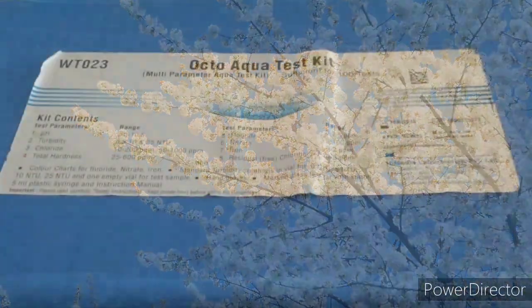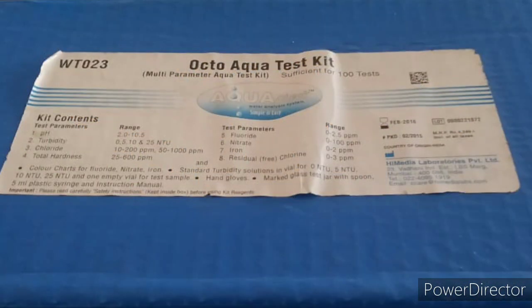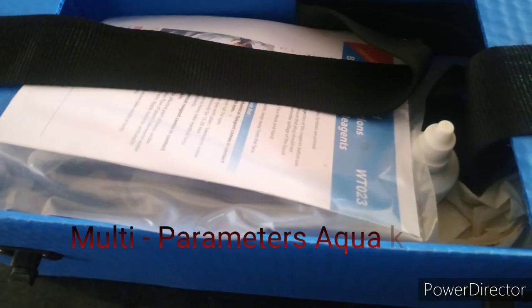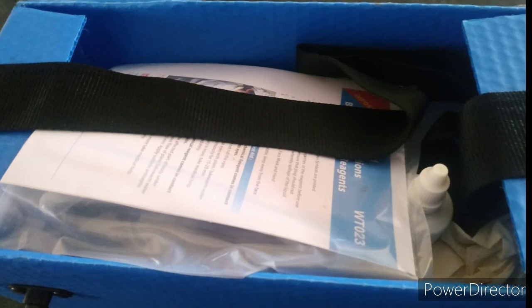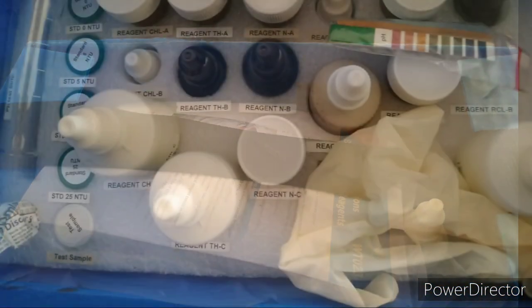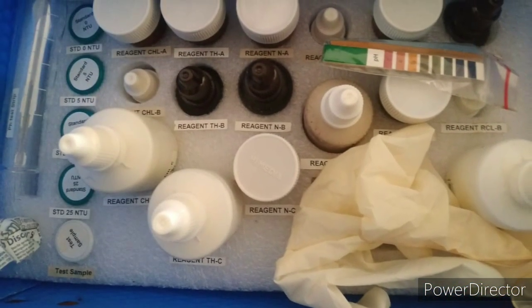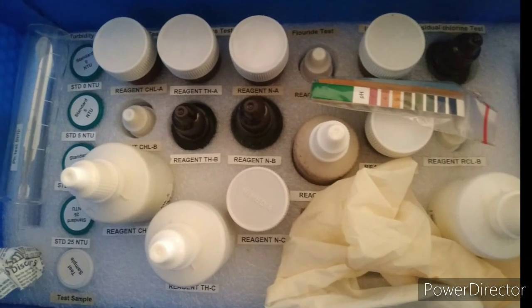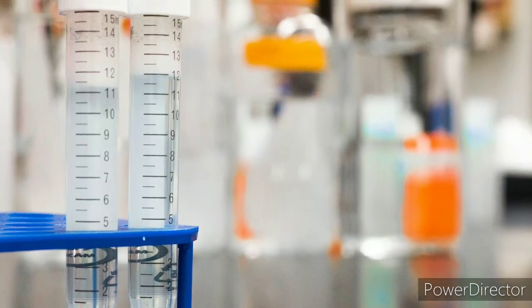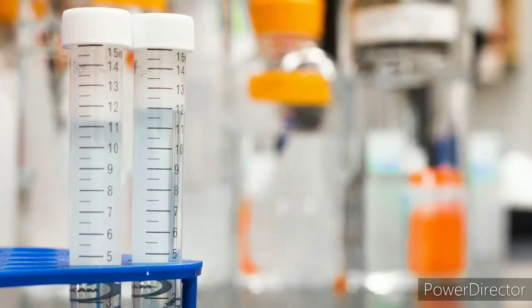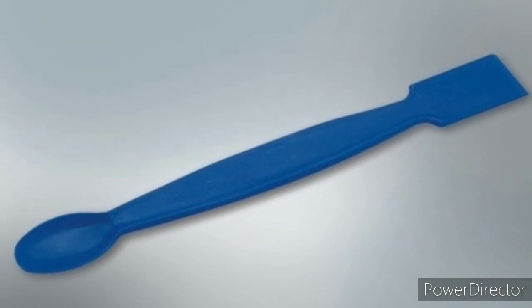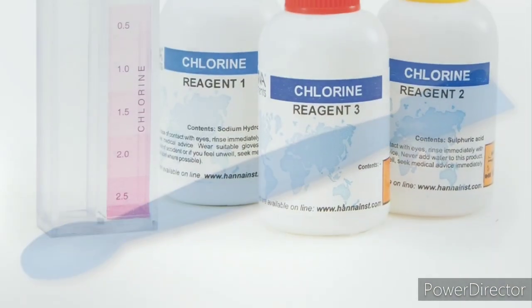Multi-parameter aqua test kit. It consists of a booklet which you can see here, reagents which we are using for conducting our test, a test tube, a spatula, and chlorine reagent.